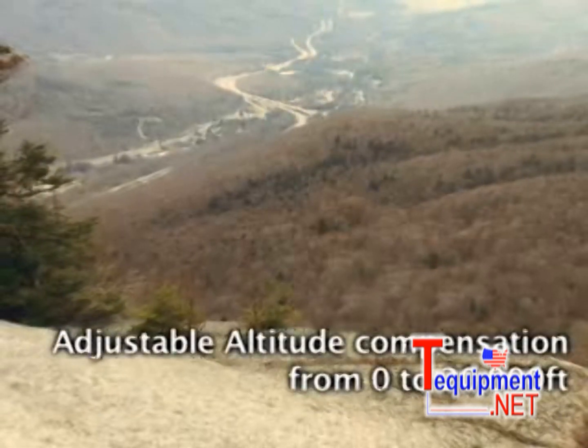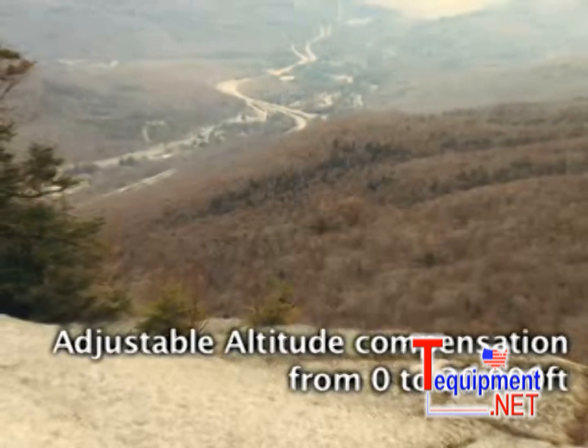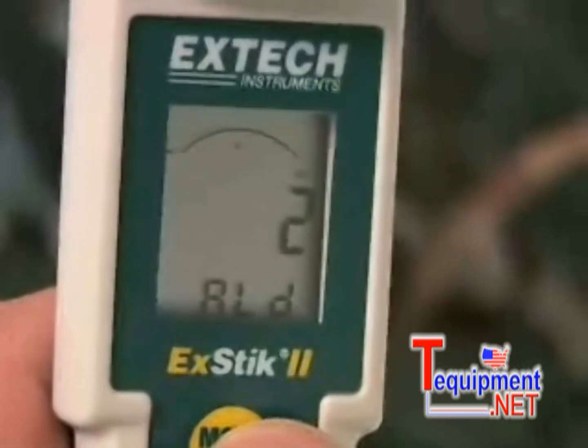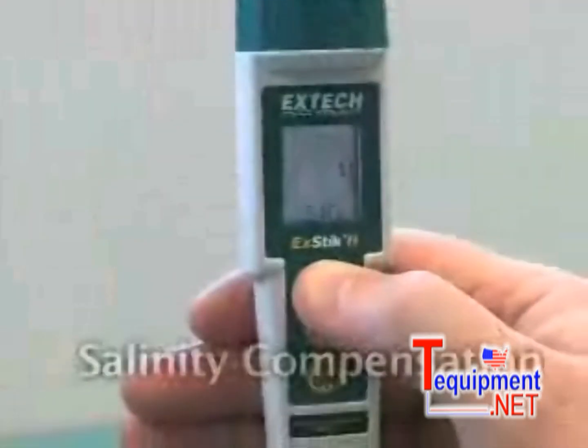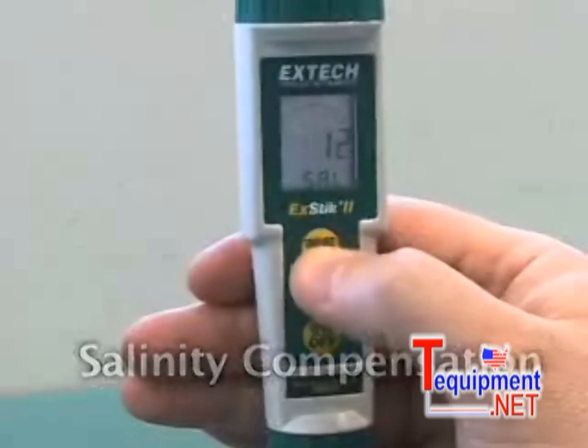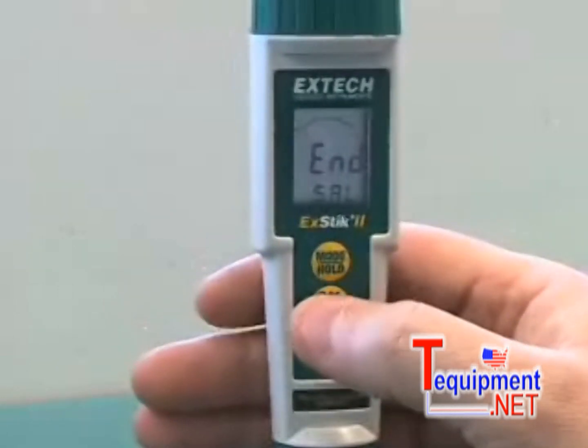Adjustable altitude compensation allows you to select the altitude in which you are taking your measurement in increments of 1,000 feet. Salinity compensation allows you to correct for the amount of salt in brackish or sea water, giving you an accurate measurement of dissolved oxygen.